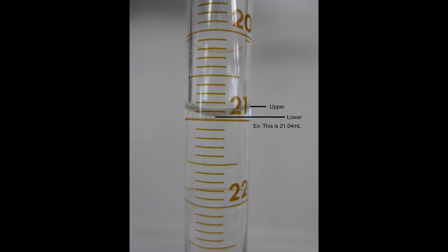Additionally, before performing the experiment, you will also need to record your initial amount of sodium hydroxide, or NaOH, present in the burette. To read and record the volume using a burette, you will lower yourself to eye level with the meniscus of the solution. By reading the lower dip of the meniscus, you will record the volume to 2 decimal points.